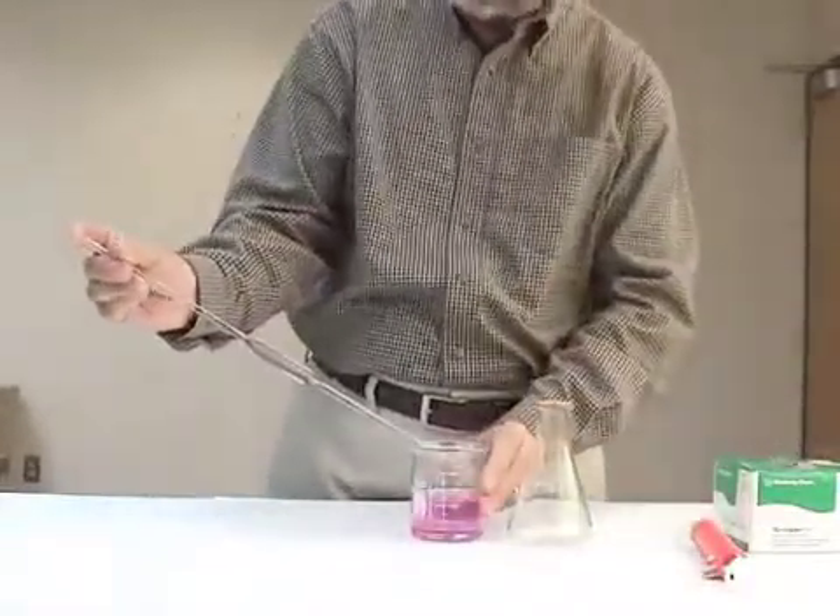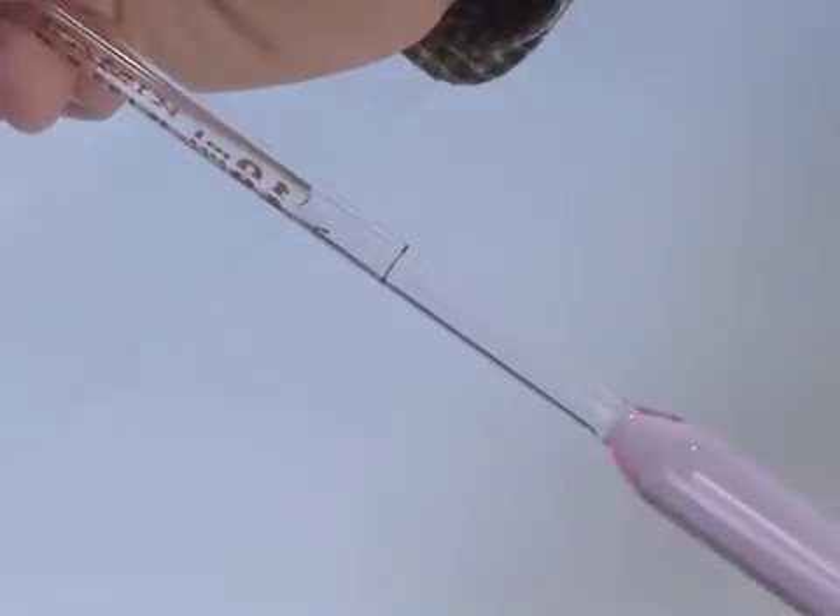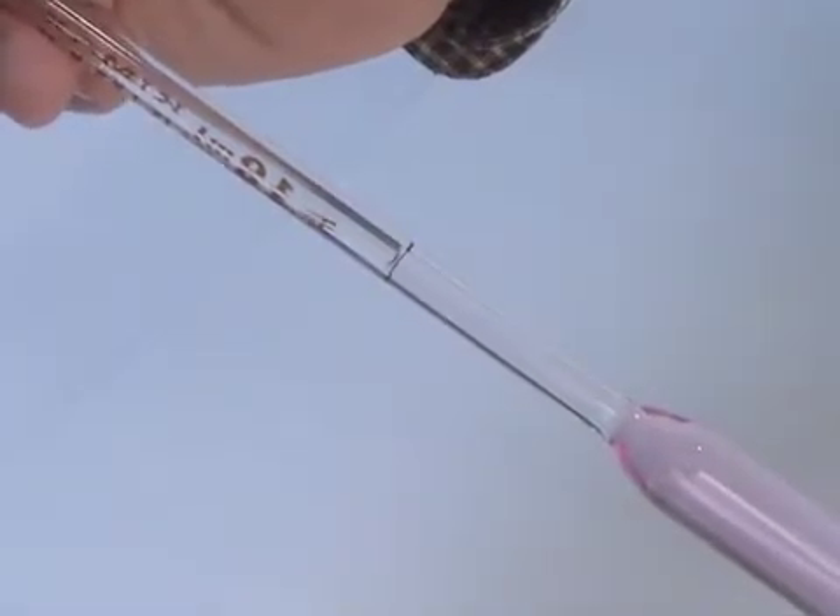Next, you'll have to adjust the volume inside the pipette so that the meniscus is just equal to the mark on the pipette. You do this by adjusting the pressure with your finger and allowing the solution to flow slowly to the mark and stop it right on the mark.